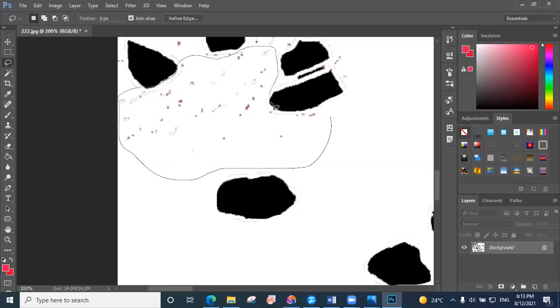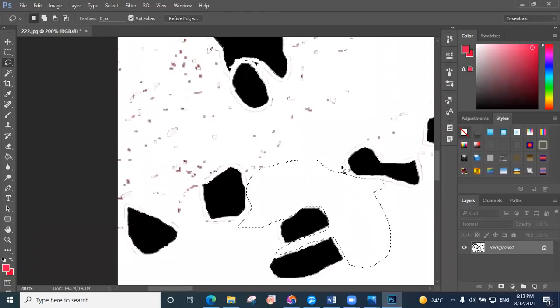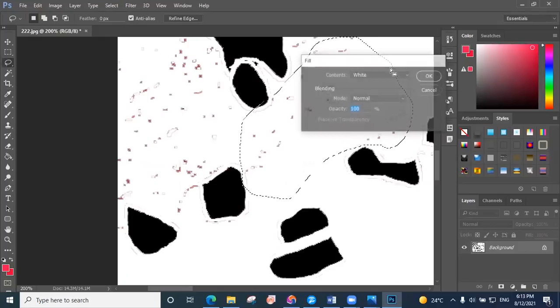I recorded everything that you could face when you are using this method to calculate the grain size. And it's the best method, I think. I haven't found another way better than this.